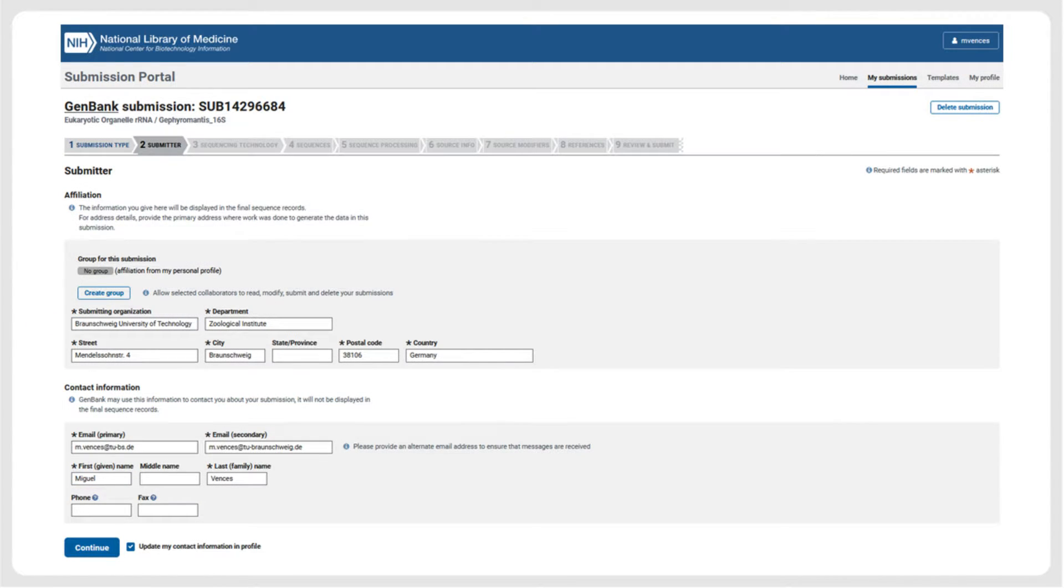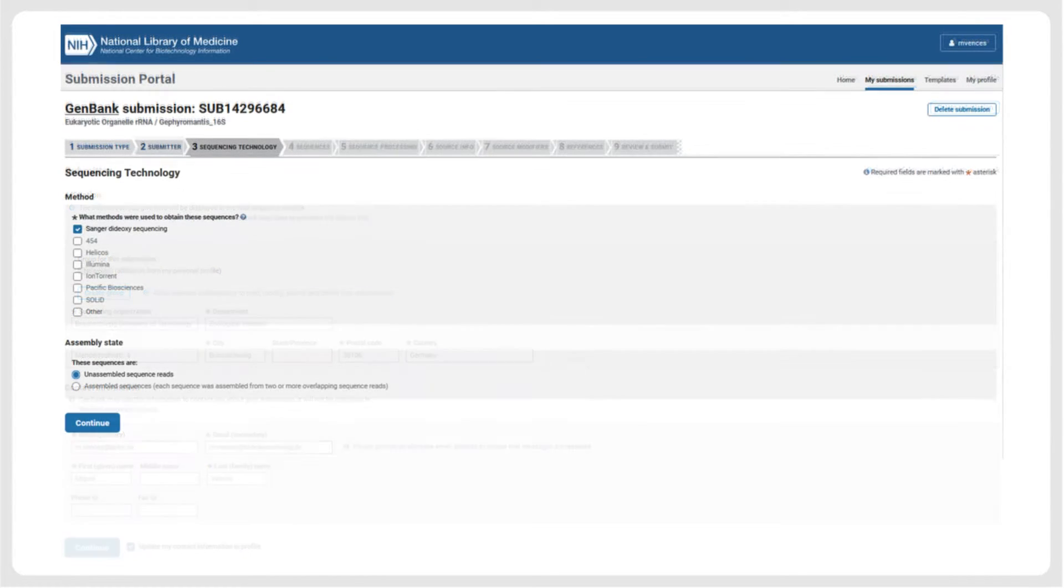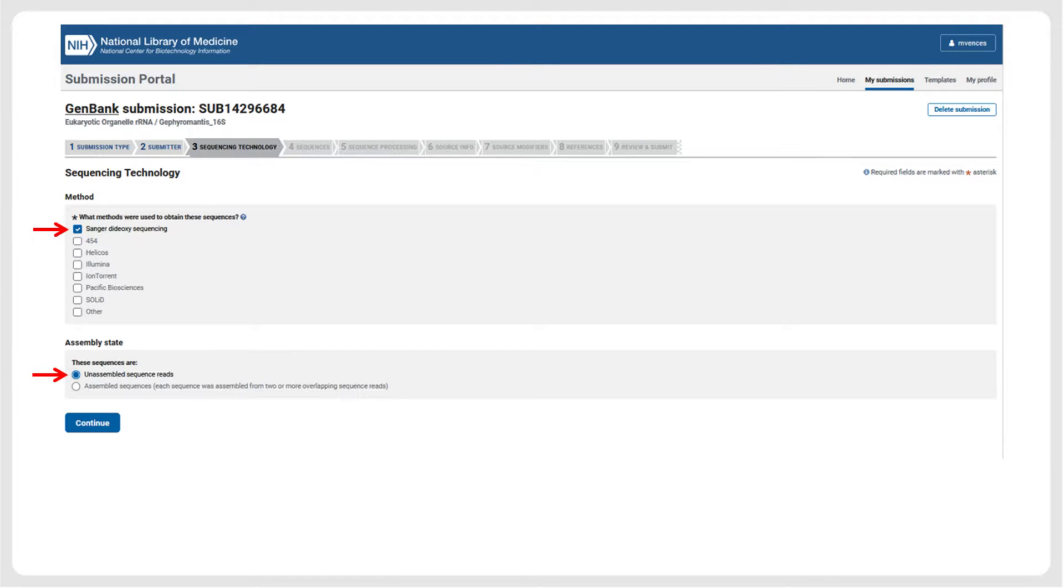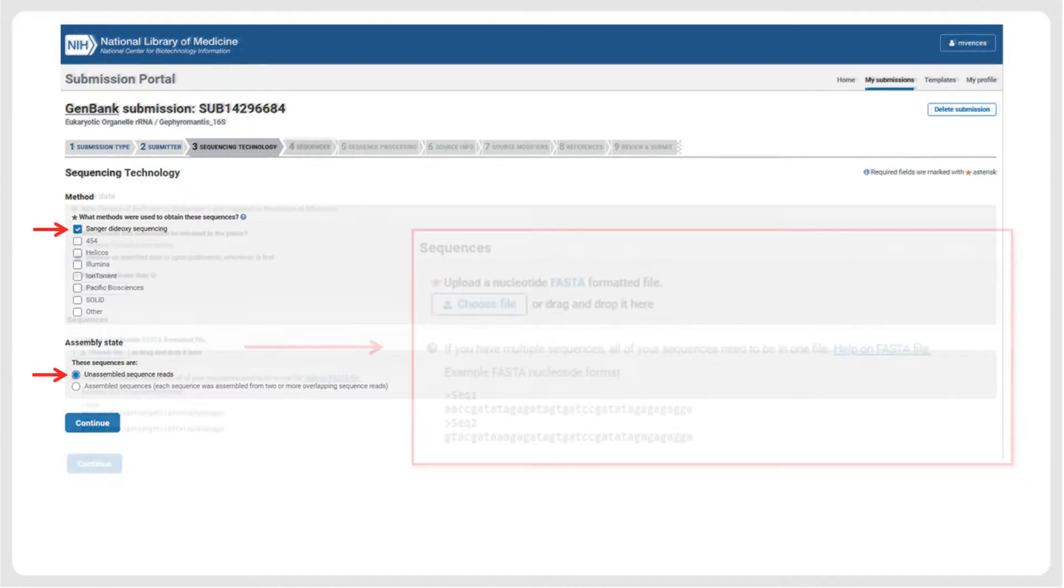On the next page, the contact information of the submitter needs to be specified. In the first step, we need to specify the sequencing technology, which in our case is Sanger sequencing without subsequent assembly.